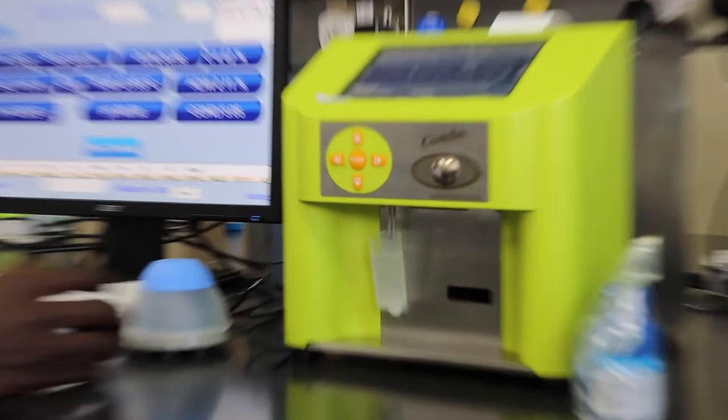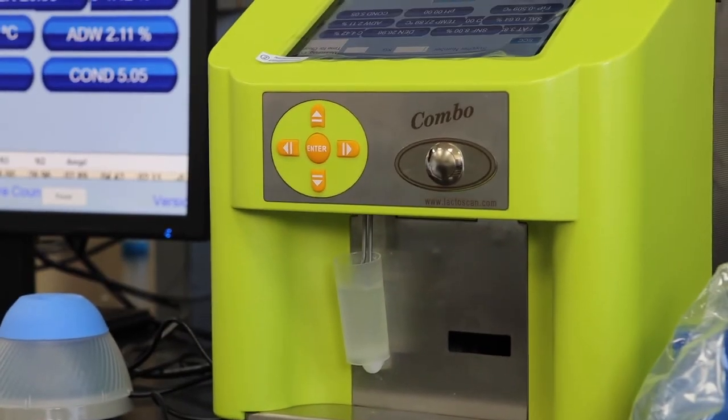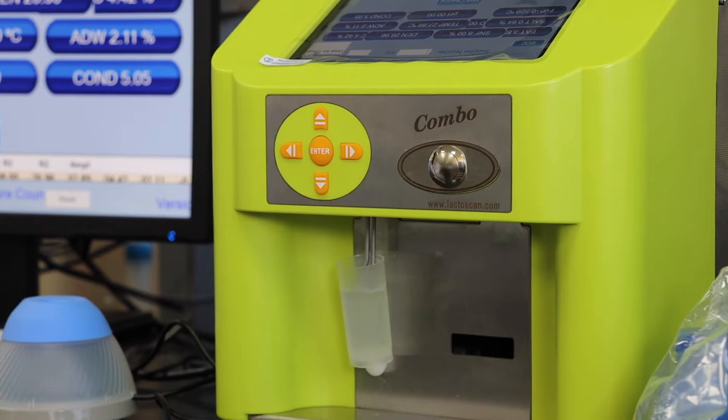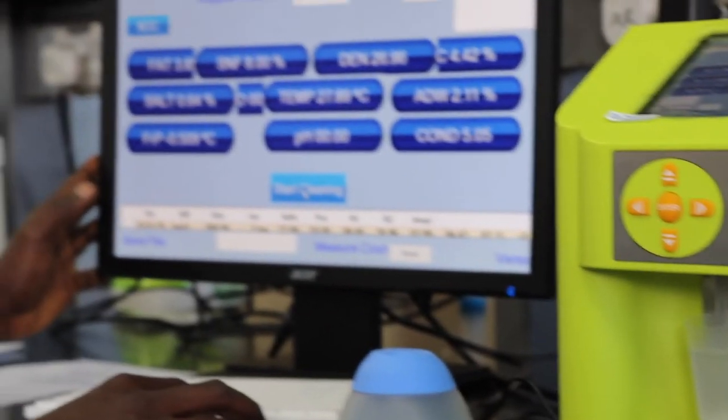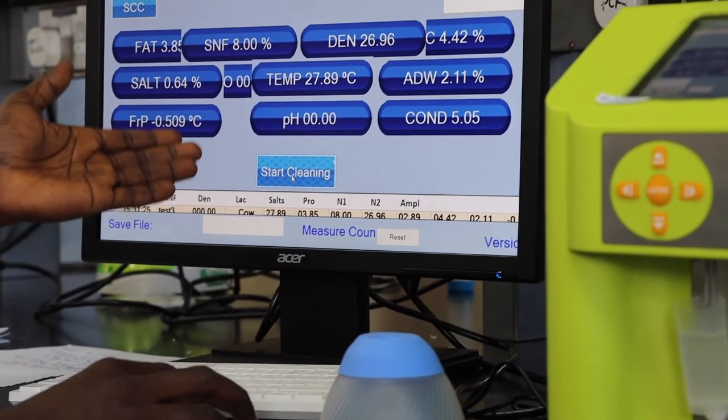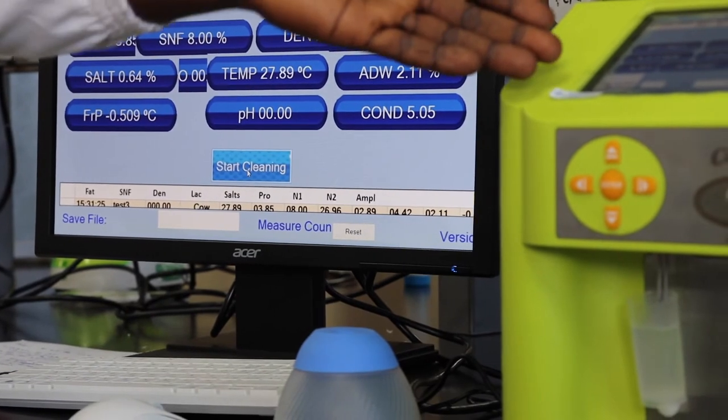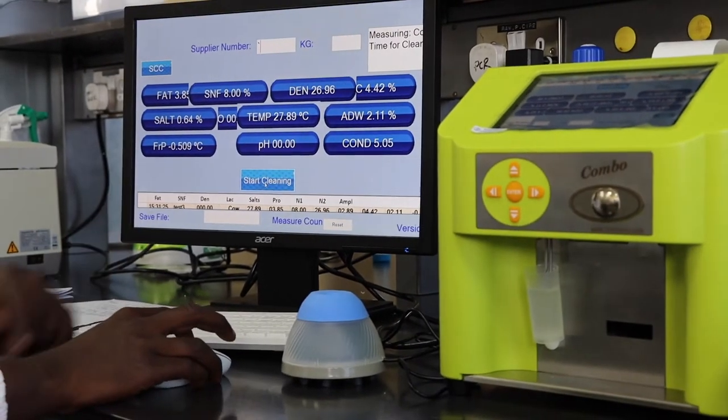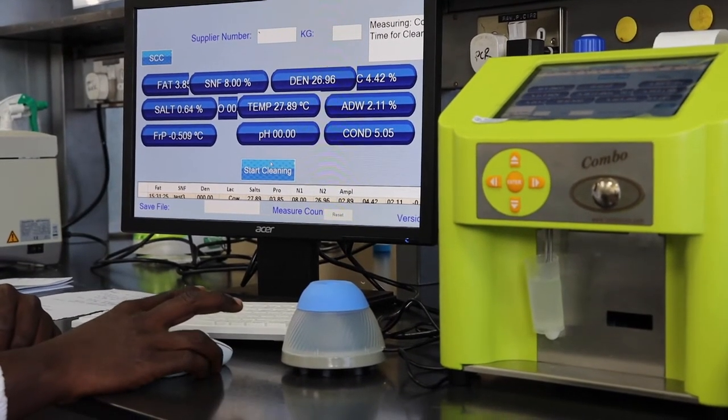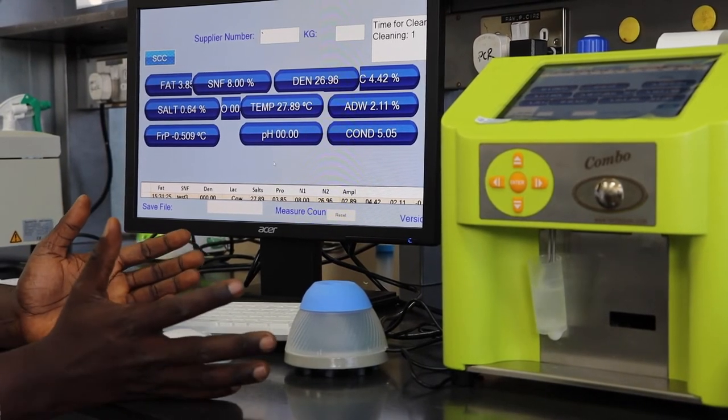Once the prompt is there, cleaning is as easy as ABC on your monitor or on your control unit, which can be the monitor or the tablet mounted on the equipment. Just click on the start cleaning button and cleaning goes on.